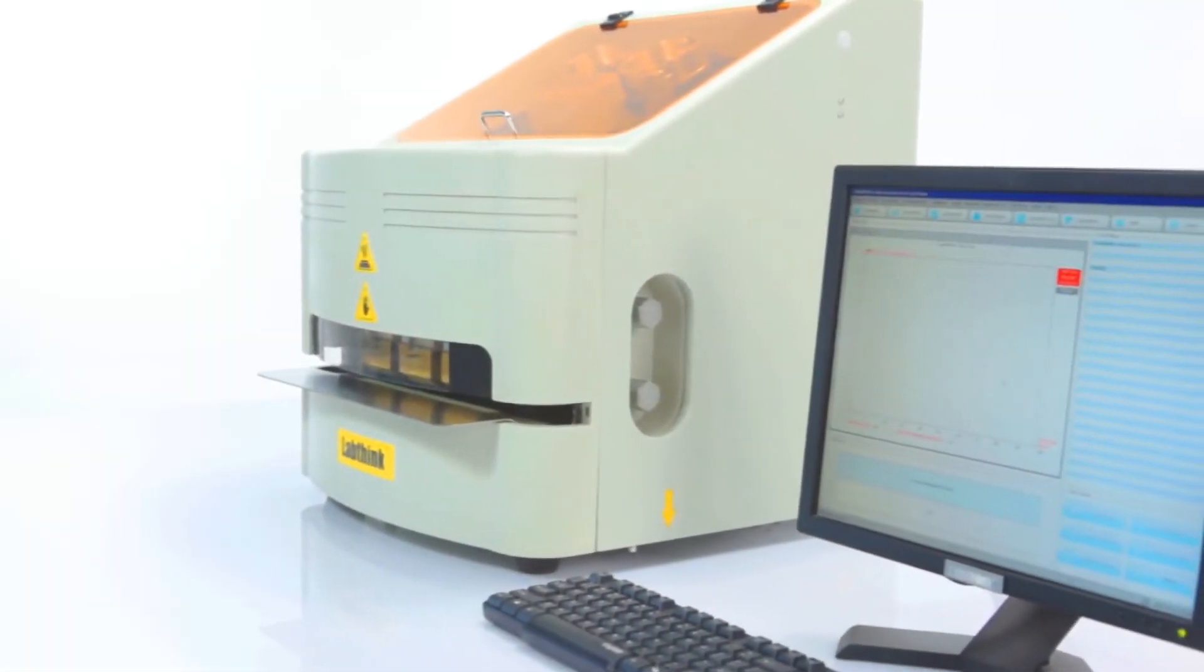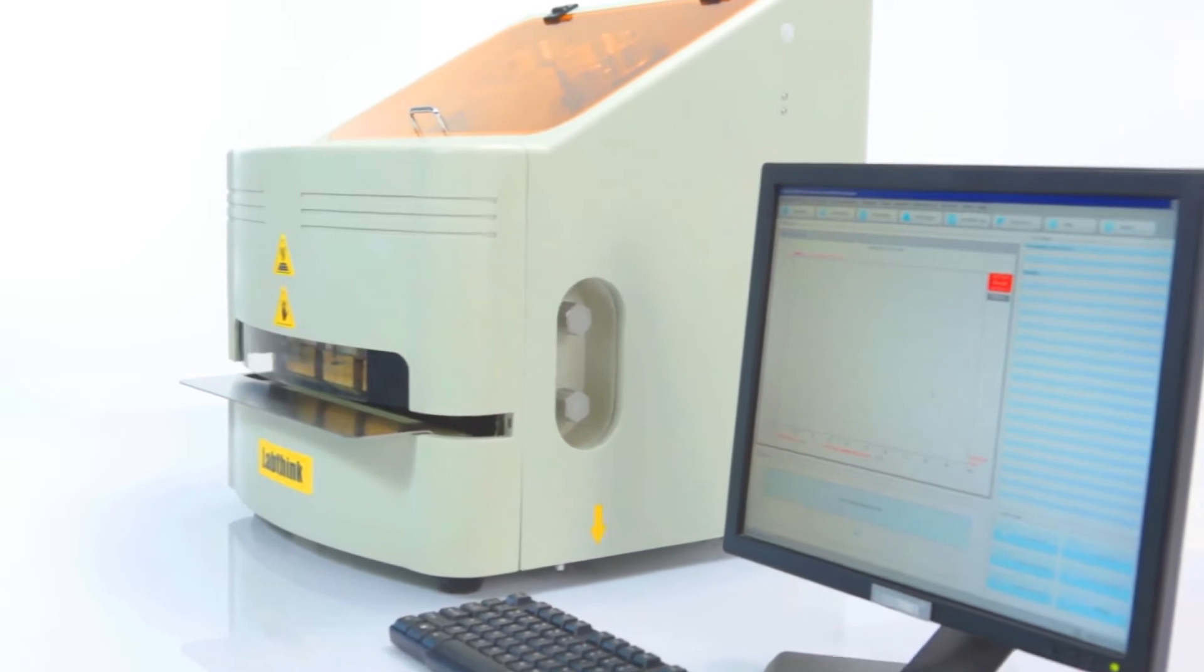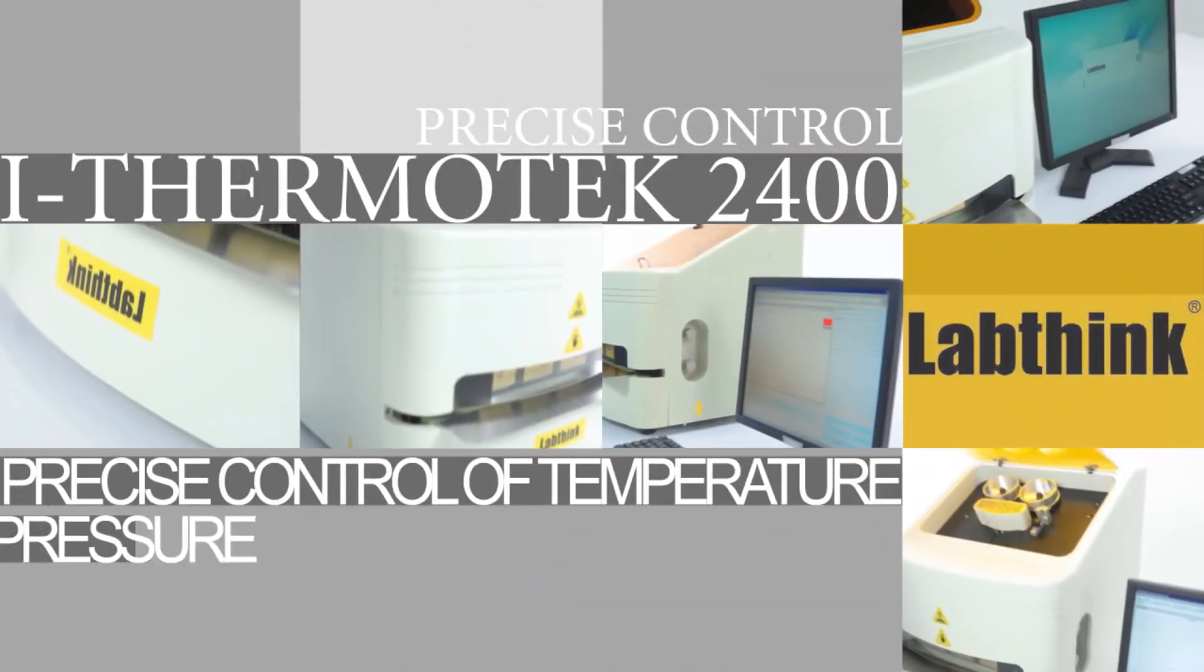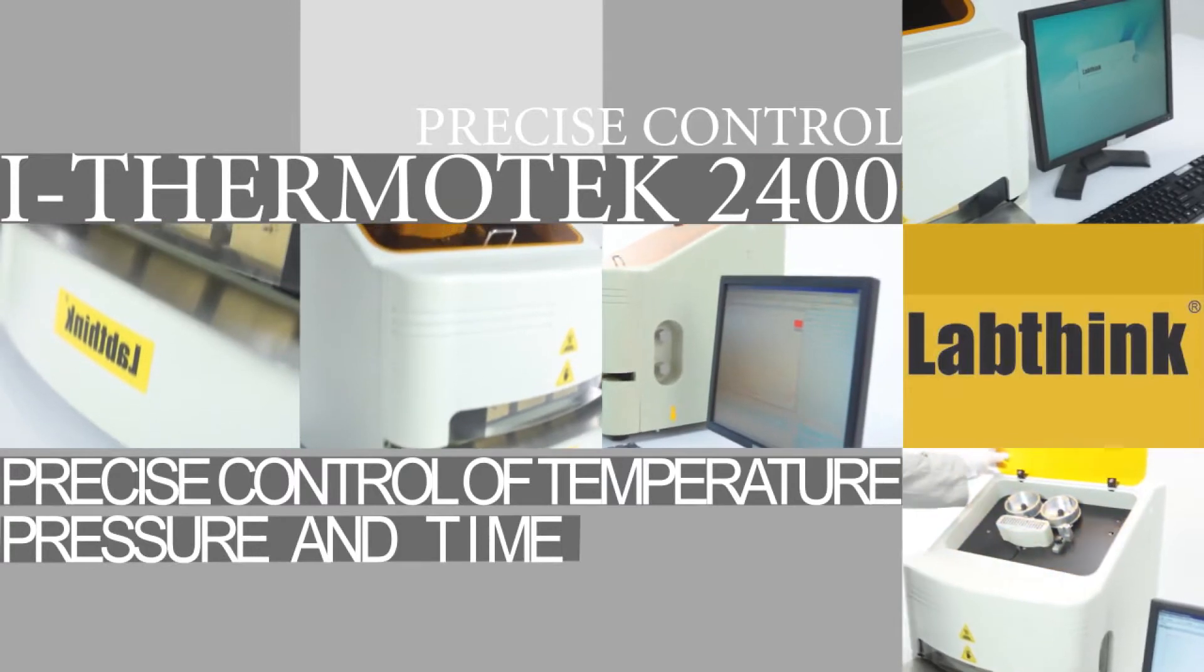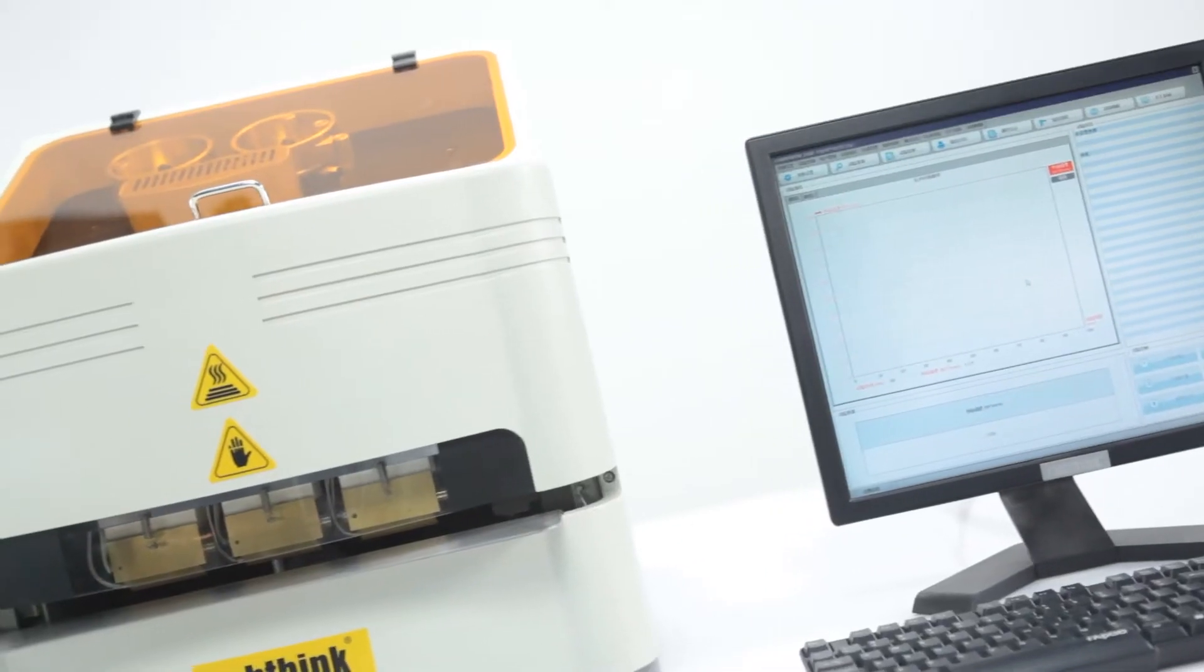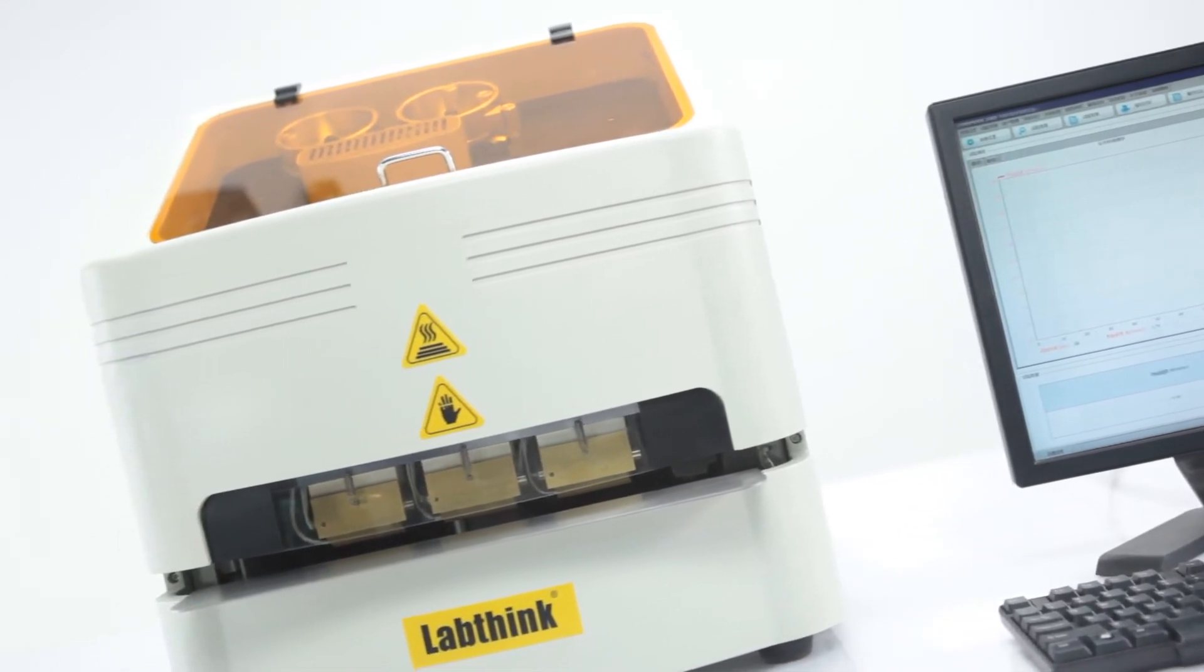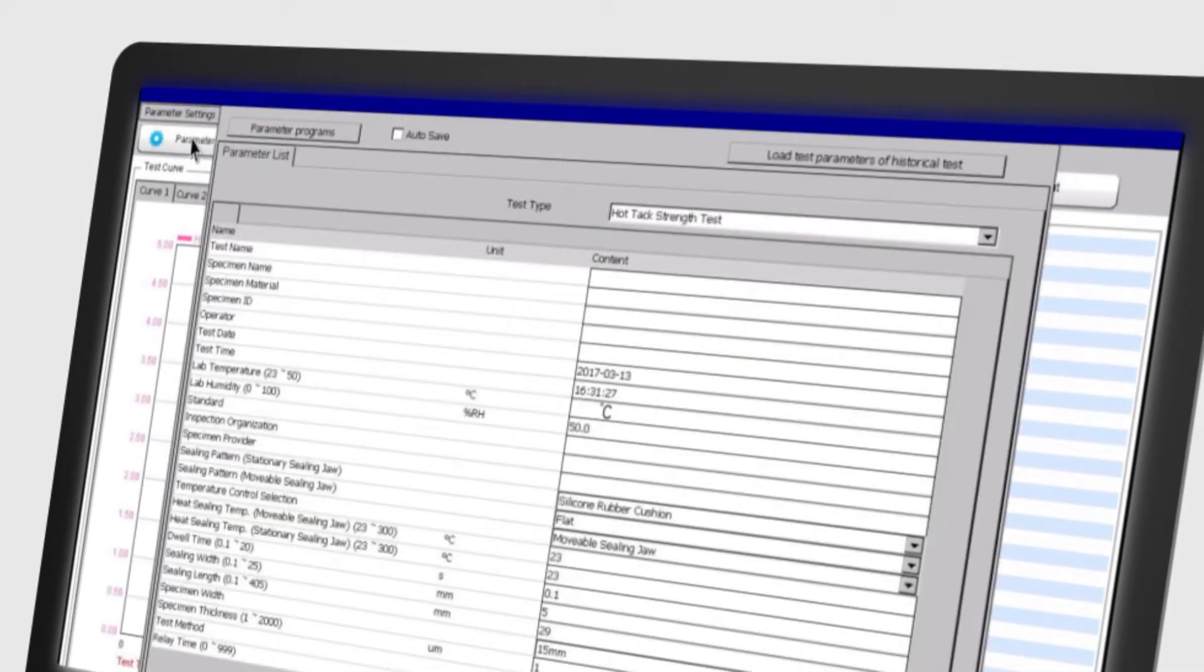i-Thermotech 2400 provides a wide range and precise control of temperature, pressure and time. Owing to its featured PID temperature control system with self-tuning and self-adaption functions, temperature can be controlled precisely from room temperature to 250 degrees Celsius with the accuracy up to plus or minus one degrees Celsius.